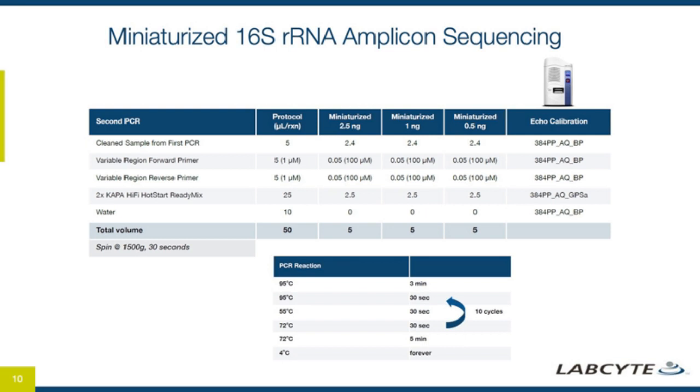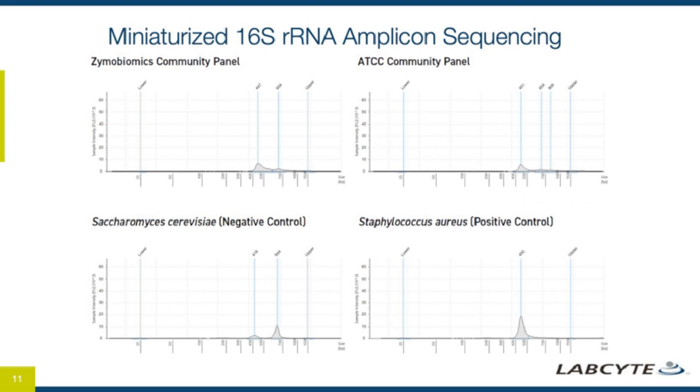Once again, Echo calibrations on the right for transferring these solutions and our PCR cycling conditions below. So once that is all done, we wanted to QC our library, and here you'll see electropherograms of each of the samples that we tested.